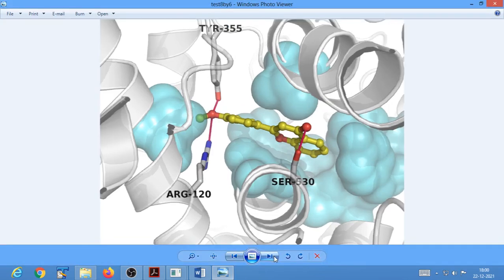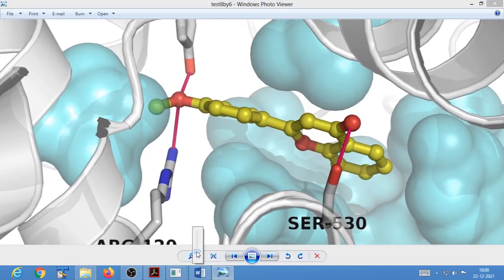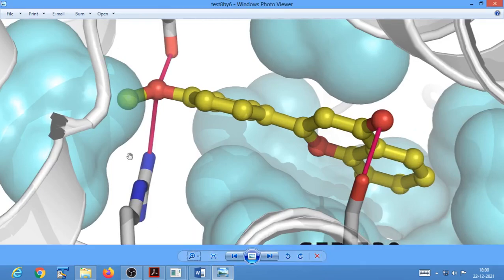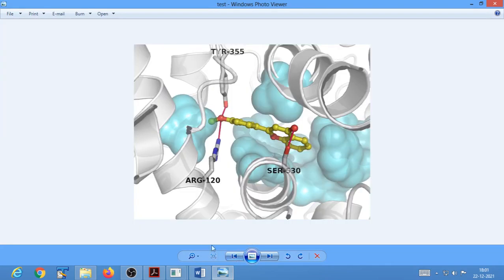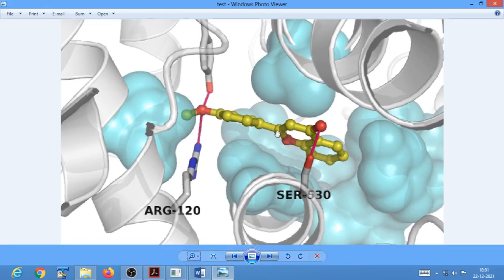Well, now let us see the next image and try to zoom in. Now you can see, even if you go into this much detail, it still doesn't pixelate. Well, that means this is a high resolution image, and this, my friends, is a low resolution image because it starts to pixelate.